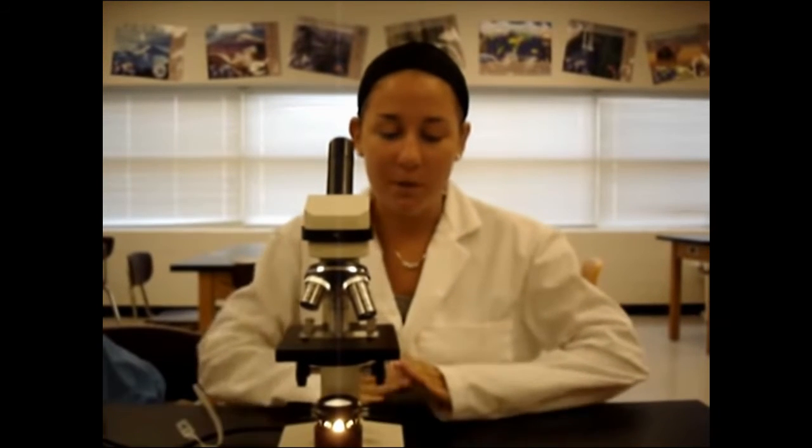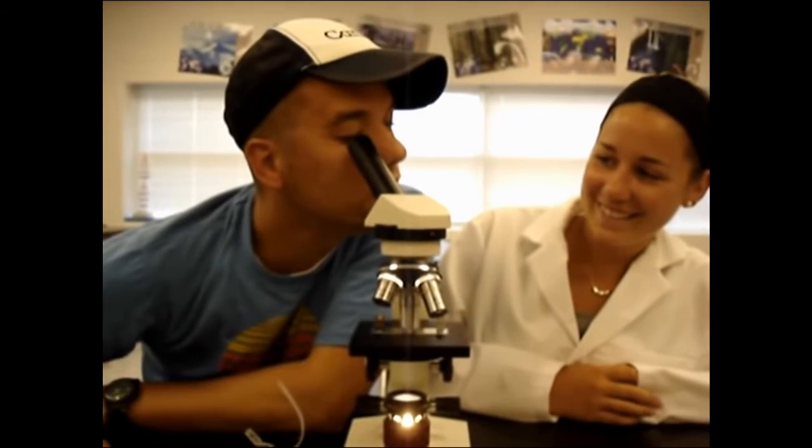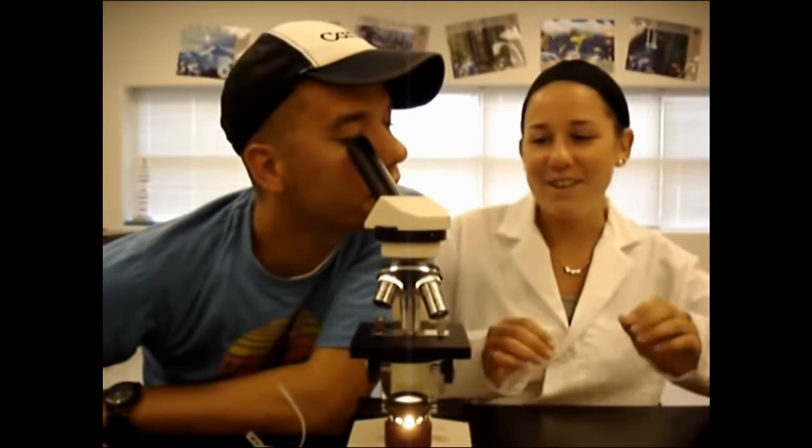If you want to see it even closer, turn it to high power, which has a blue stripe. With high power, you can only use the fine focus knobs to focus your image. If you want to share your image with a partner, don't move the whole microscope — always keep the microscope away from the edge of the table. Instead, just turn the lens.